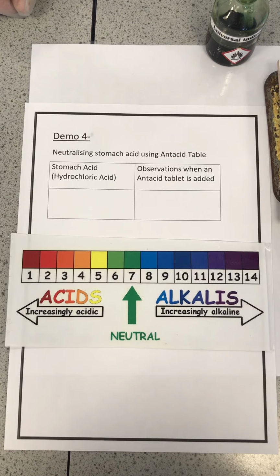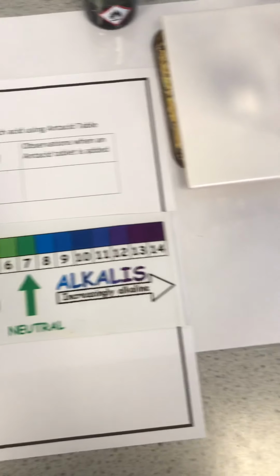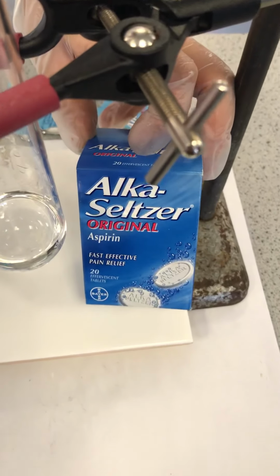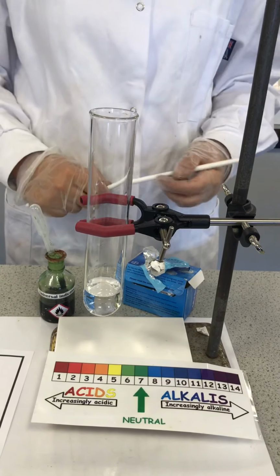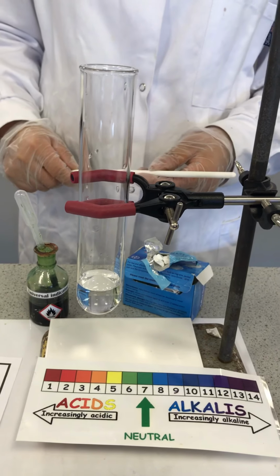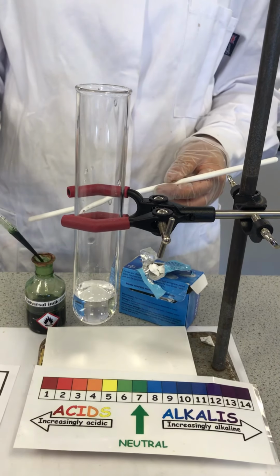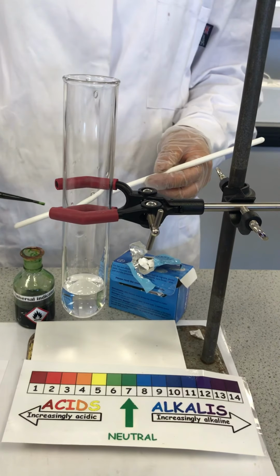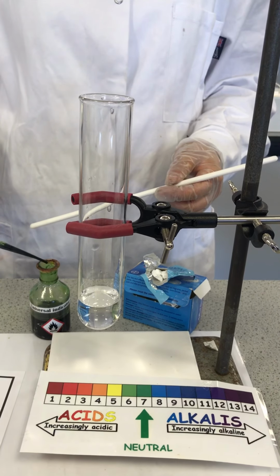Experiment 4. Neutralizing stomach acid using an antacid tablet. An antacid tablet is a substance which neutralizes stomach acidity to relieve symptoms of heartburn, indigestion, or an upset stomach. We have here in a boiling tube hydrochloric acid, which represents our stomach acid. It will be very interesting for you to know that our stomach produces hydrochloric acid as it helps in digestion of food. These antacids neutralize the excess acid sometimes produced in the stomach.